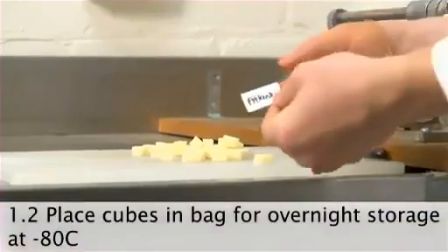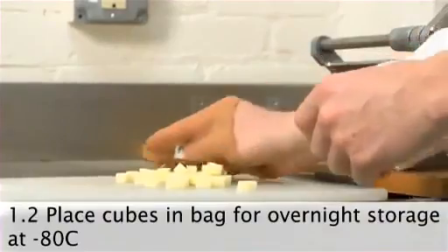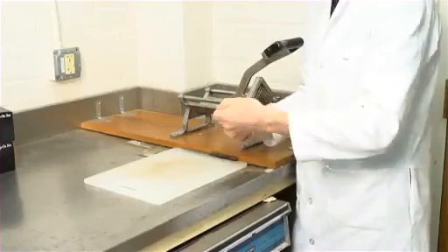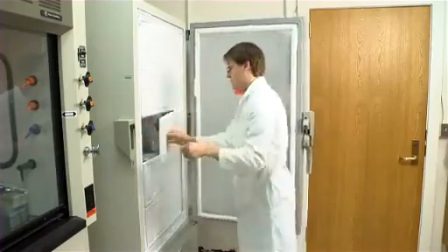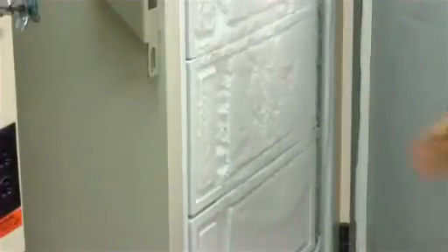The cubes are placed into a labeled bag. We use nylon socks, such as those used in shoe stores. They're inexpensive and allow samples to dry quickly and evenly in the lyophilizer. The nylon bags containing the samples are placed into a paper bag and frozen overnight at -80 degrees C.